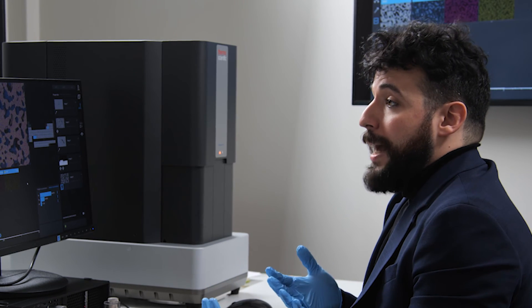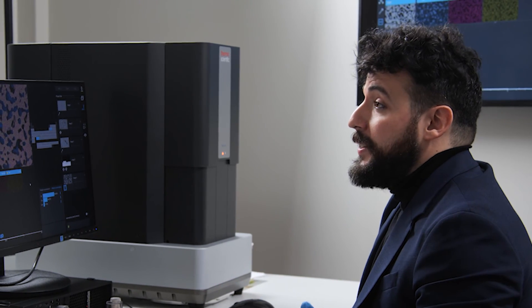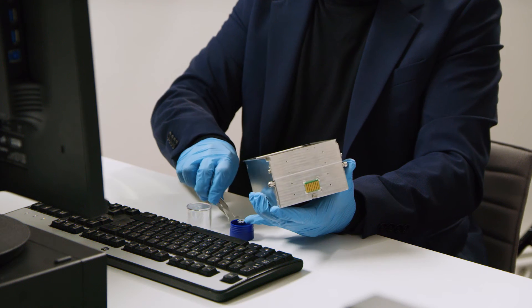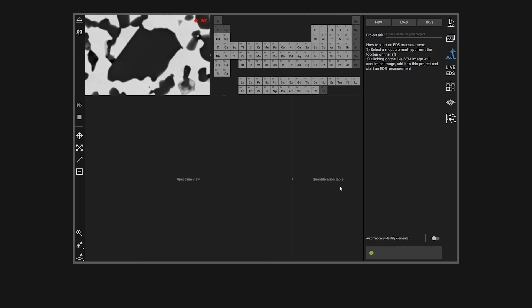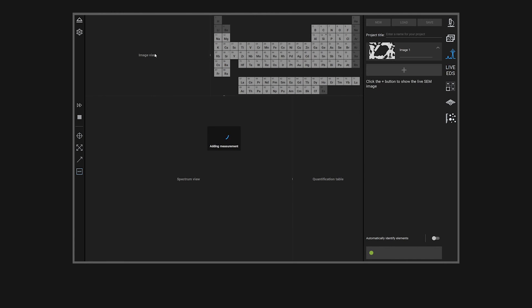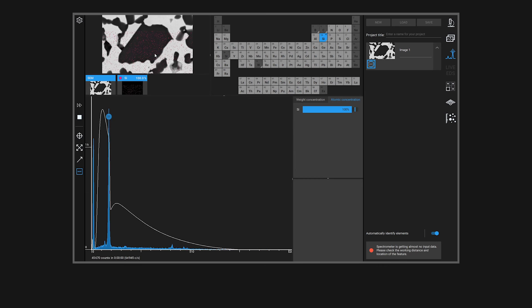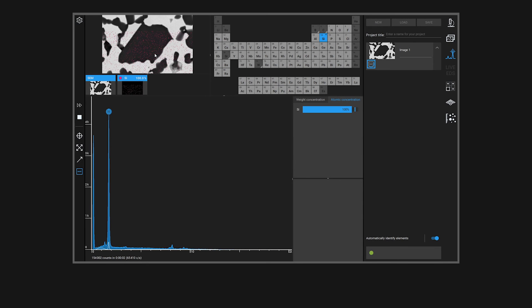The quantification technique that we use in Phenom is extremely fast. This allows us to generate EDS maps in a matter of a few seconds. The problem with peak overlapping doesn't only impact spot analysis — it becomes much more complicated when it impacts an EDS map. In this example we're looking at silicon, tantalum, and hafnium in a high-temperature resistance alloy, and all these elements have peaks that overlap both at low energy and high energy.